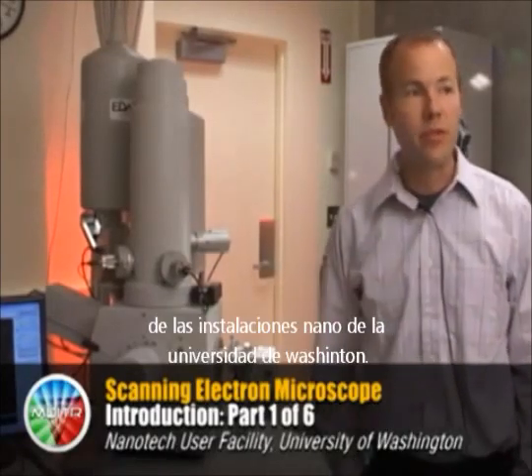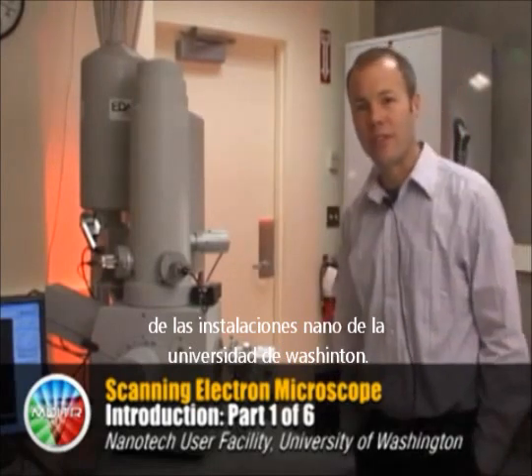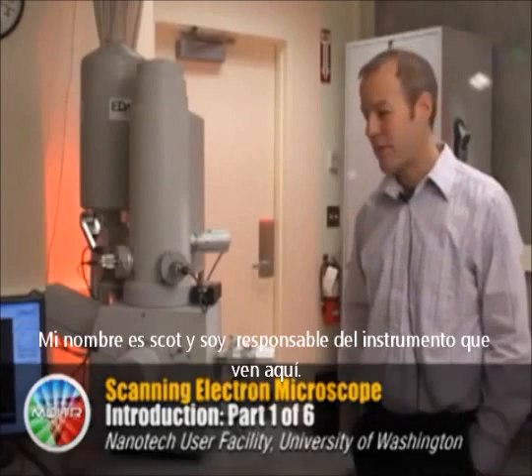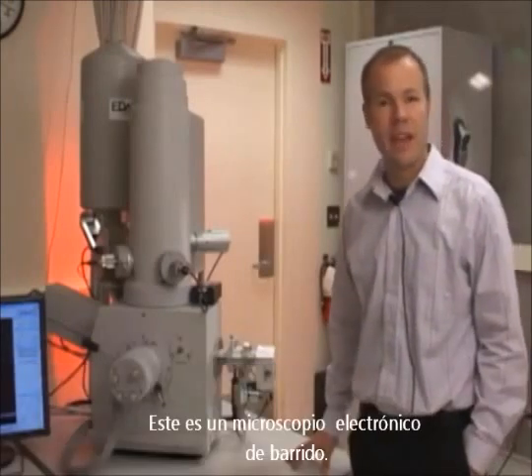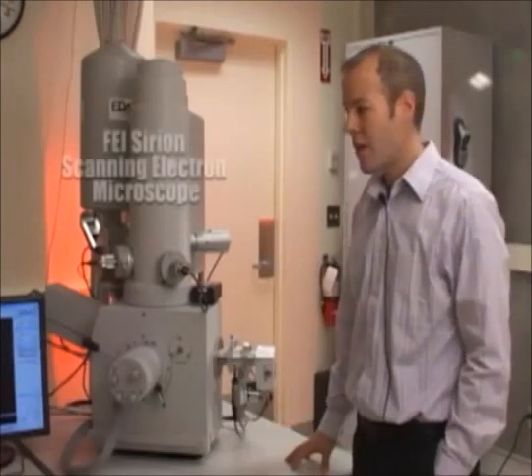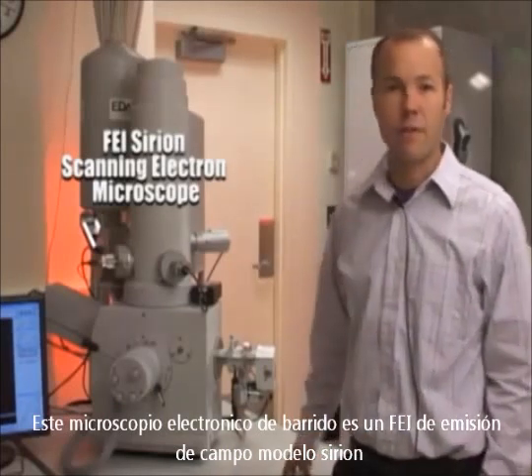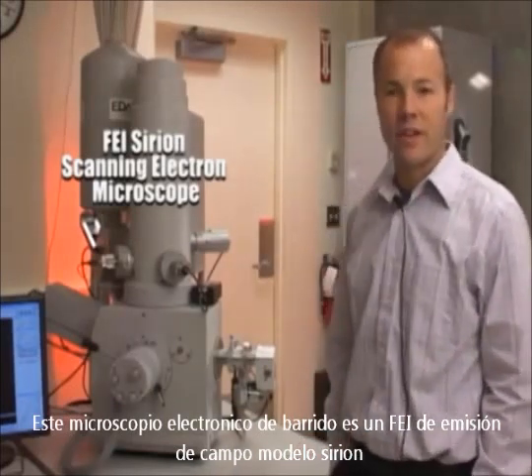Welcome to the E-Beam Suite at the Nanotech User Facility at the University of Washington. My name is Scott Braswell and I'm responsible for this instrument that you see here. This is a scanning electron microscope, an FEI. The model is a Sirion, a field emission scanning electron microscope.